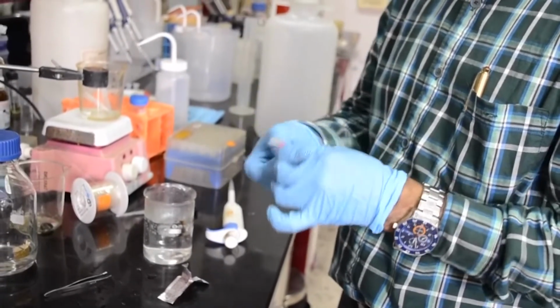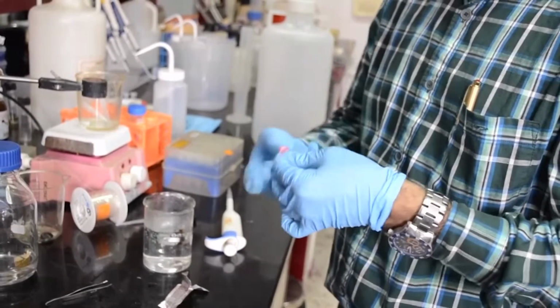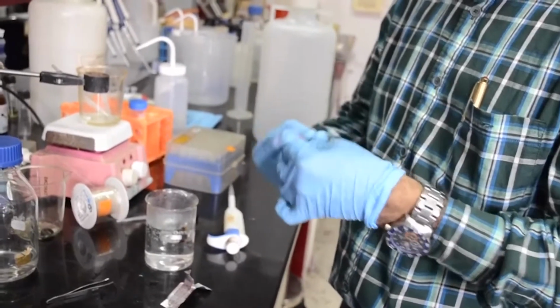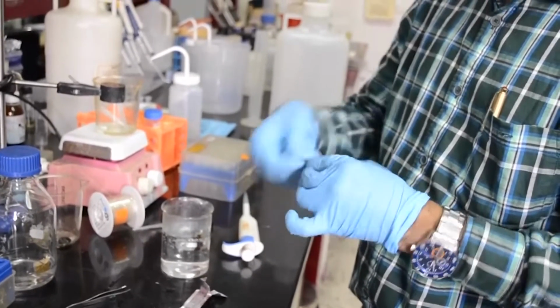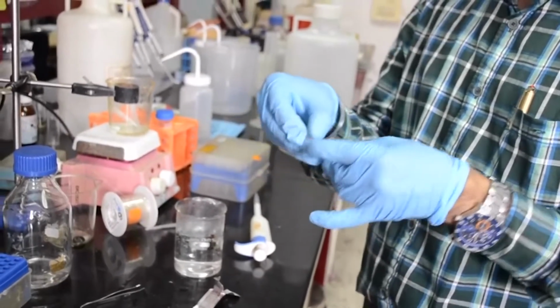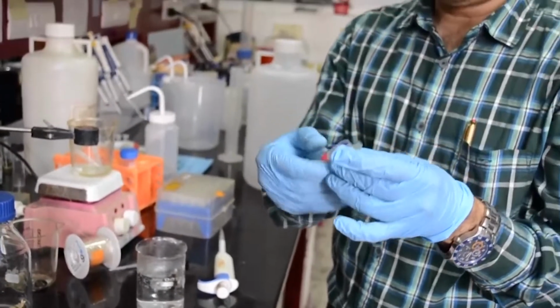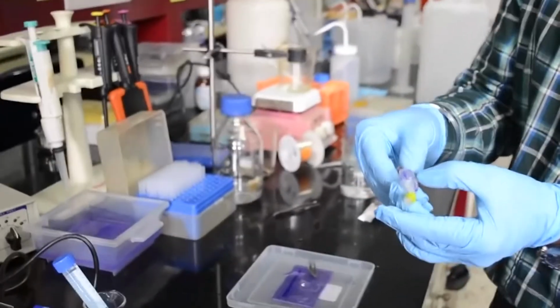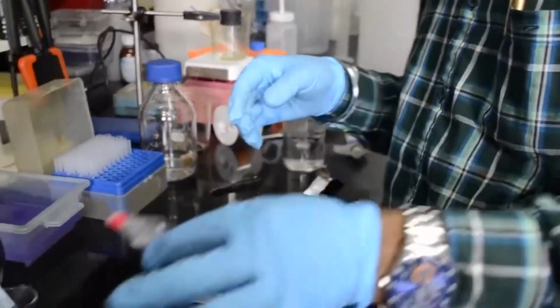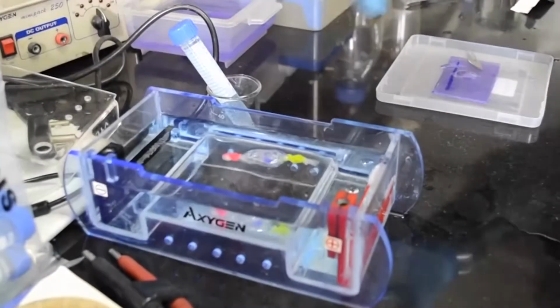If you want, you can even use dialysis clips as well, or you can even use thread. The purpose is only to close this so that you can make a bag like this. Now you can see that the band is inside. And now what you have to do is submerge this into a horizontal gel apparatus.